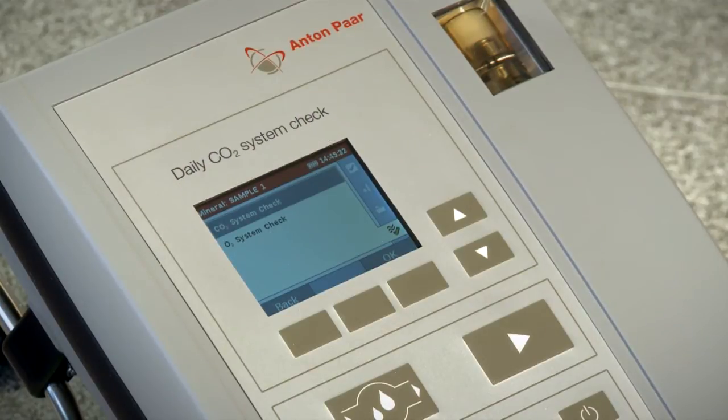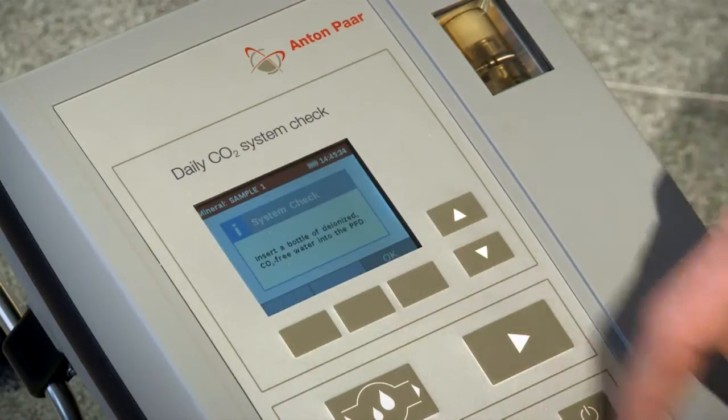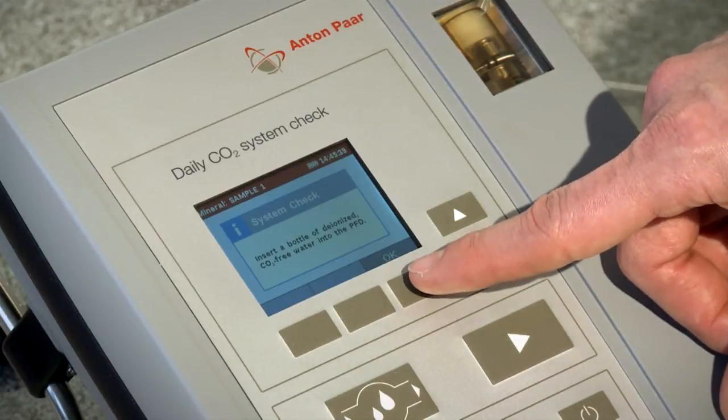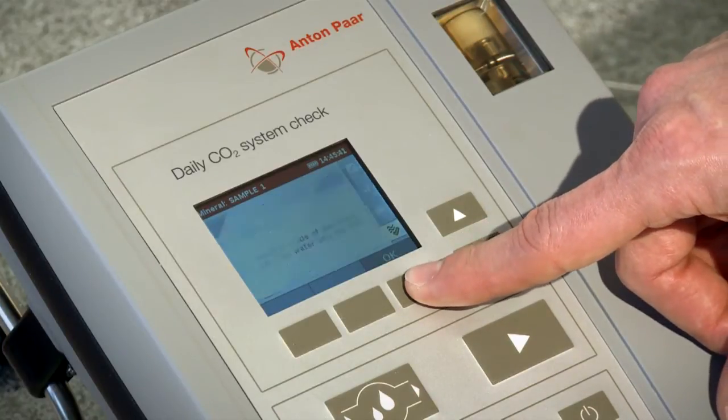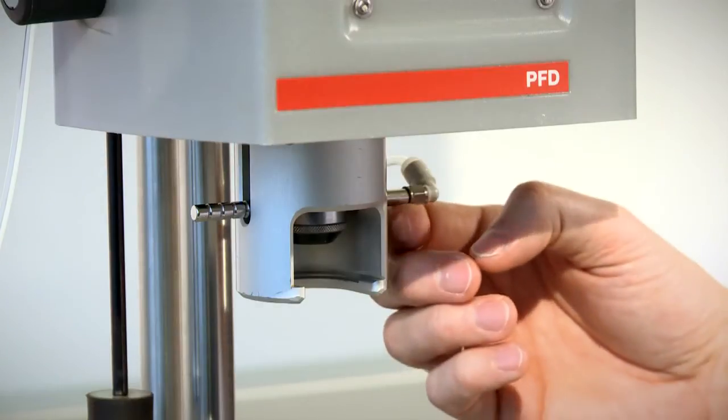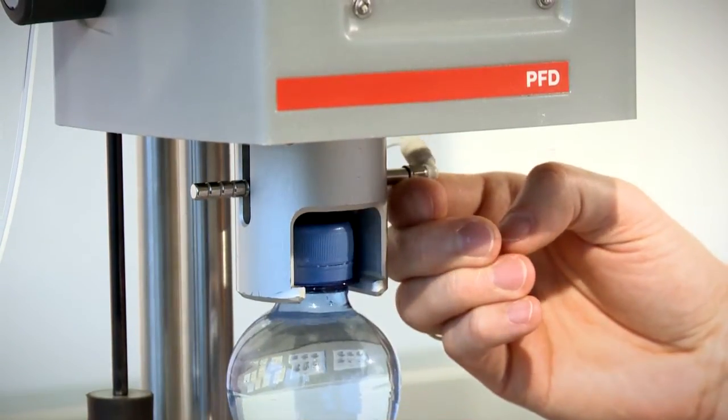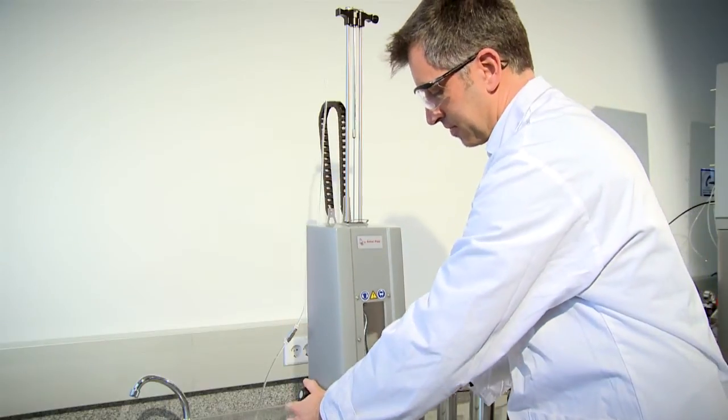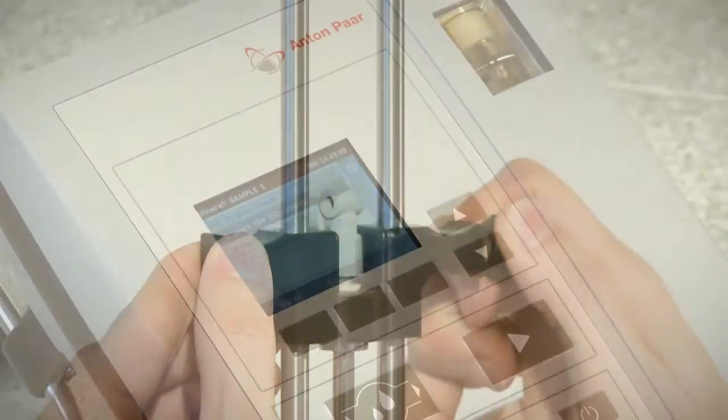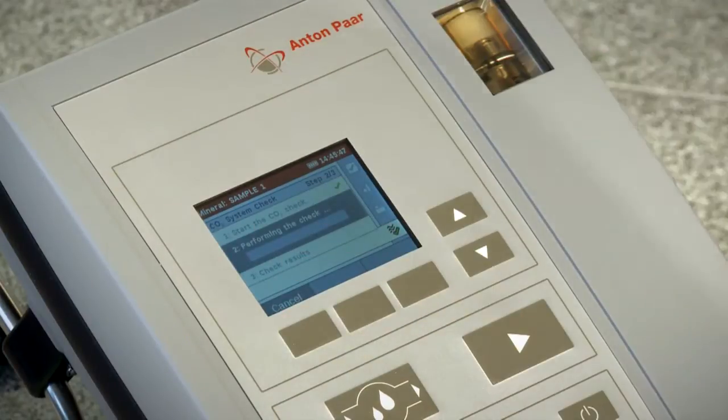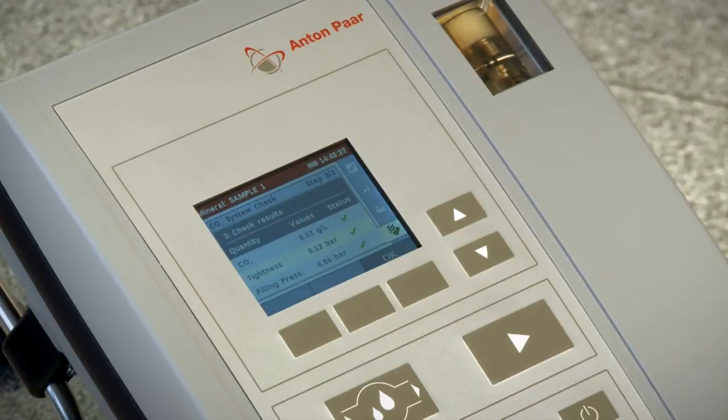The implemented CO2 system check is recommended daily before you start the first measurement procedure. Using deionized CO2-free water, you can have the system automatically check the zero point of the CO2 measurement and the tightness of the measuring chamber. These check results give you a reliable go for a long working day.